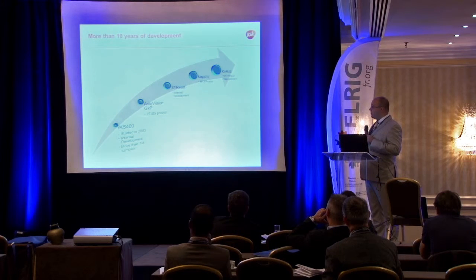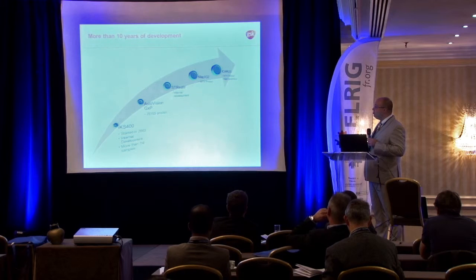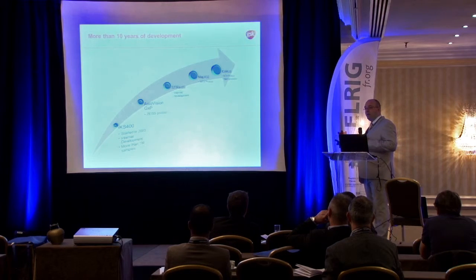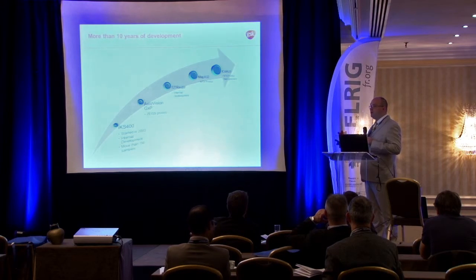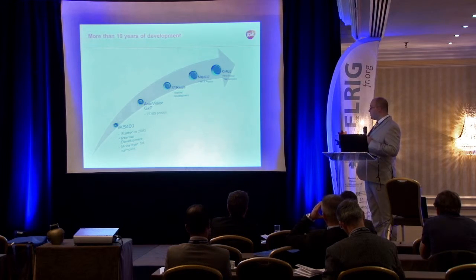But during the years, we chose also to improve the global layer management. We first started with a commercial product from Zeiss. Okay, it did the job, but we were not really fully satisfied. So we decided to come back with an internal development, something that we call Stream. But it's very hard to maintain. When you do this kind of development by yourself, you have to think about a lot of side effects. Let's say you have to deal also with the IT environment, you have to deal with the migration of OS and so on and so on. So that's a very huge job to do when you have to maintain this by yourself.